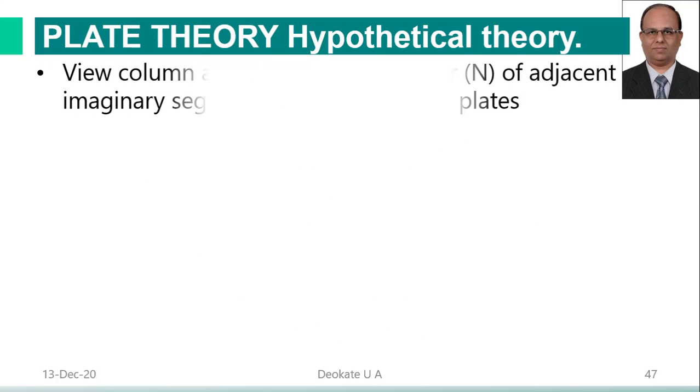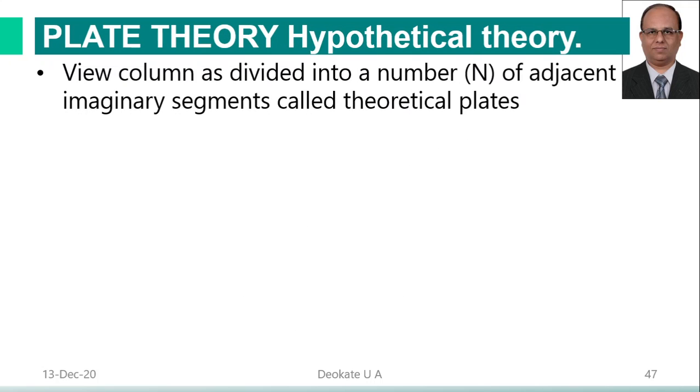Now first is the plate theory, which is a hypothetical theory in which the column is divided into a number of adjacent imaginary segments called theoretical plates, where equilibrium has been reached.